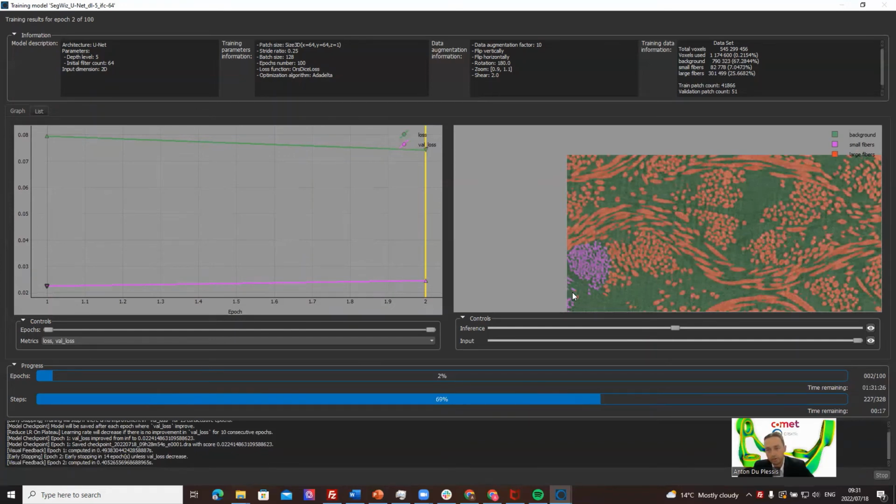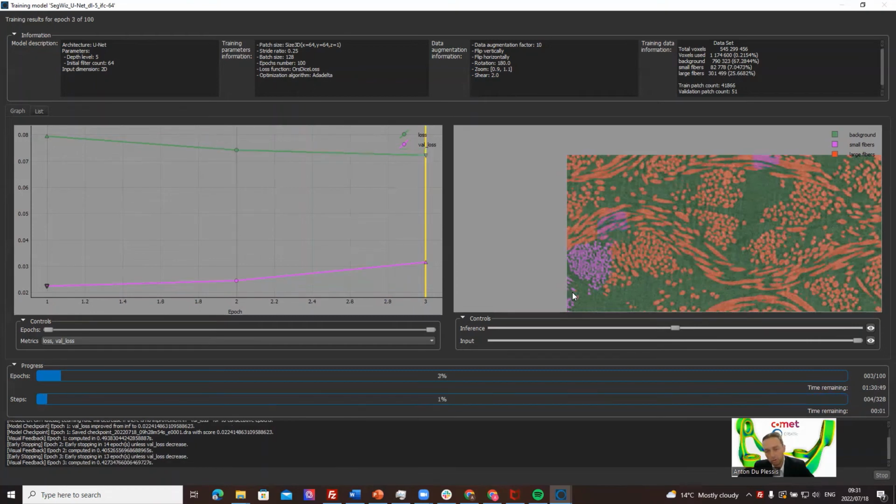I don't know if I'm going to run this through many epochs. This demo is actually not good in that sense, because you need to wait for these models to train properly. I would suggest to wait at least 10 epochs, if not more, especially after it has plateaued. You might still want to wait even more, because sometimes it still improves a lot. So obviously that's not a good result there, but that's why you would want to leave it more. I'm quite 90% confident the next epoch will be much better.